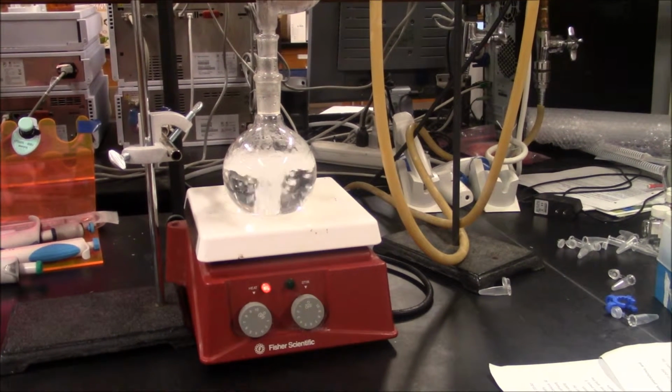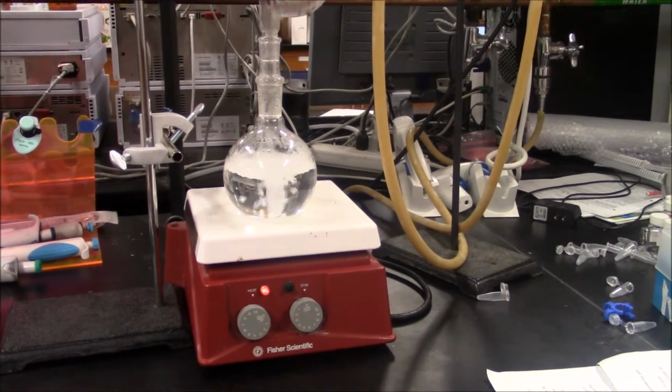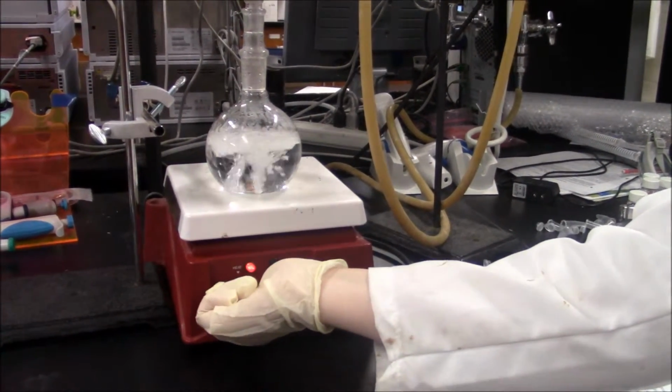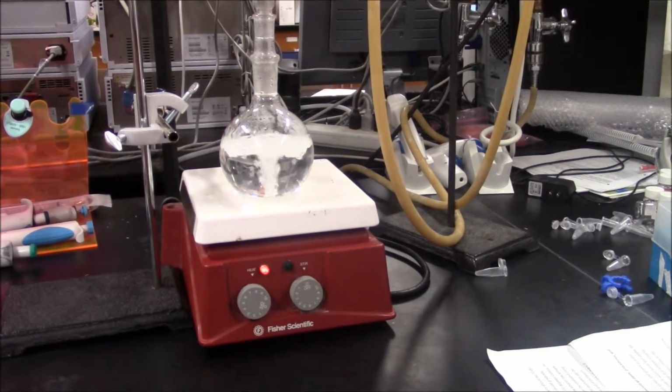To begin distillation, turn the heating plate to high power. Once the solution begins to boil, reduce the temperature slightly, but keep it high enough to allow vapor to pass all the way to the top of the column, where vapor will condense on the digital thermometer, and the thermometer reading will go up to the boiling point of ethanol.